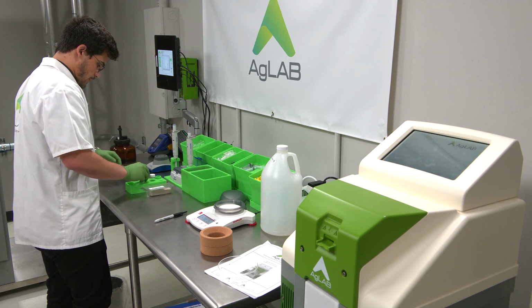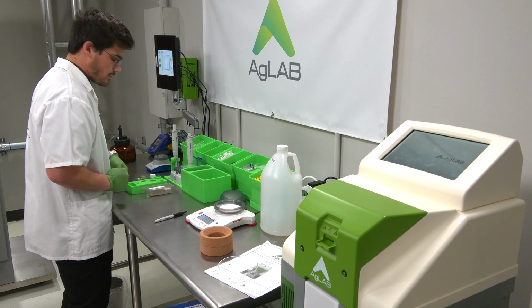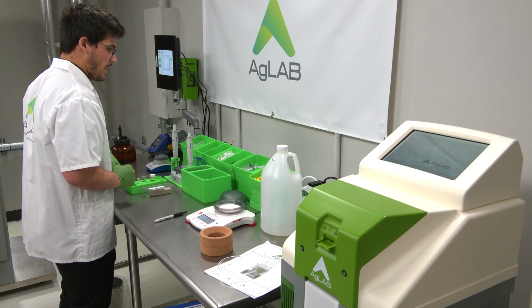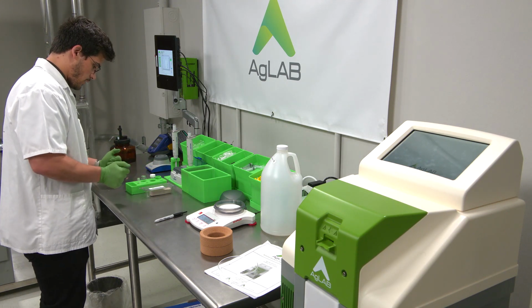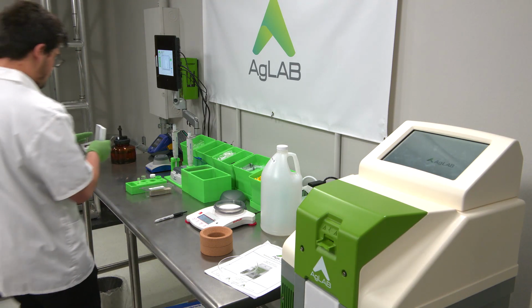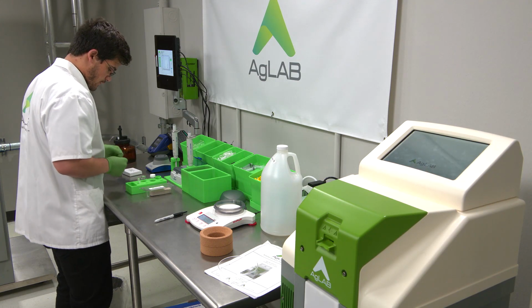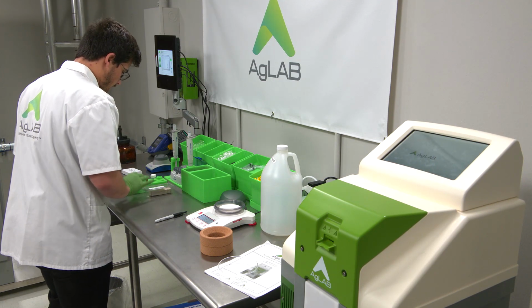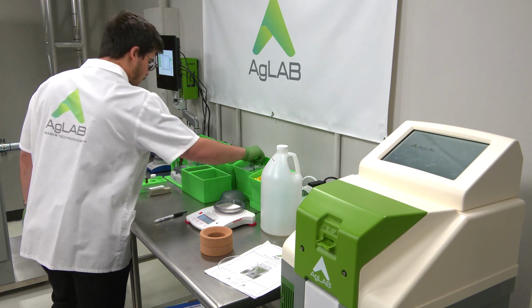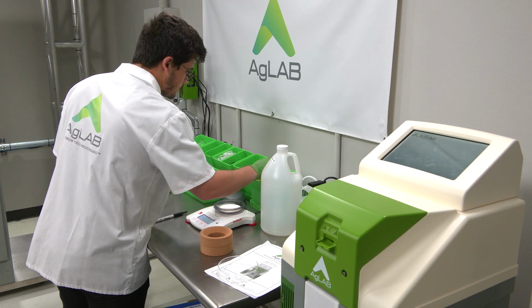All right, we have our D1 vial, the final sample vial, and I will grab our internal standard, which is in the freezer. Okay, so I have our IS fresh out of the freezer, and this is a head sample. I can go ahead and prep the syringe as well, so we have everything ready for us.